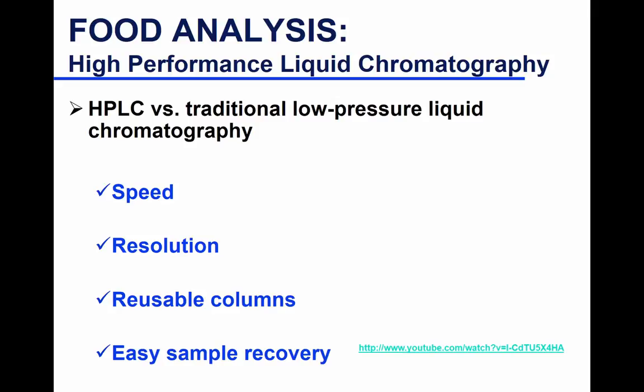You can use them depending on what type of sample you're using, but in general, 1,000 injections before they start to go bad. But they might be used longer, they might be used shorter, depending on how dirty or clean your sample is. And easy sample recovery is just because you have better resolution, your peak is sharper and you can get a purer peak than what you would get from low pressure chromatography.